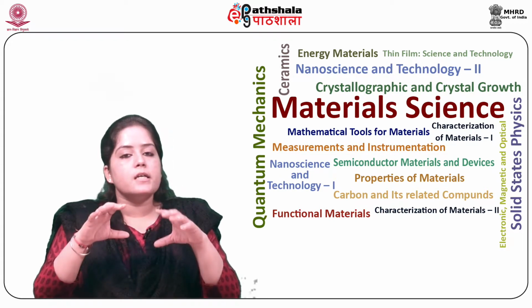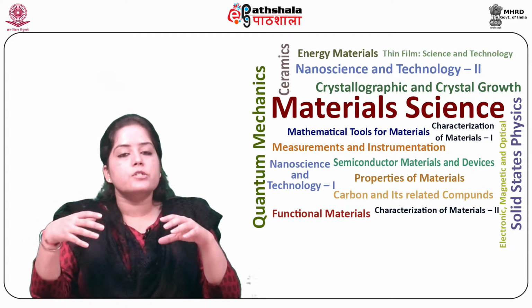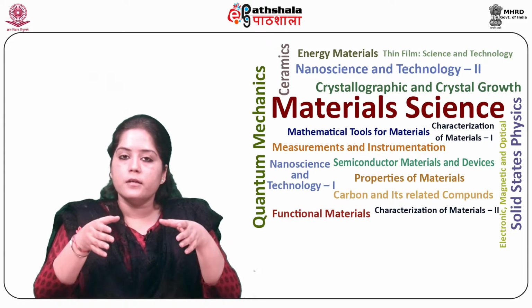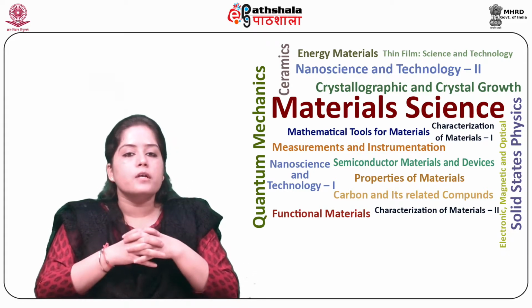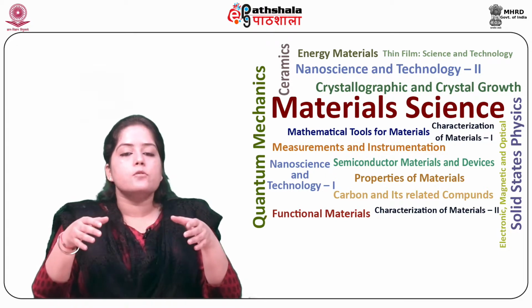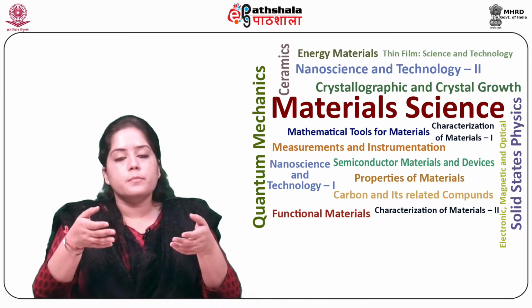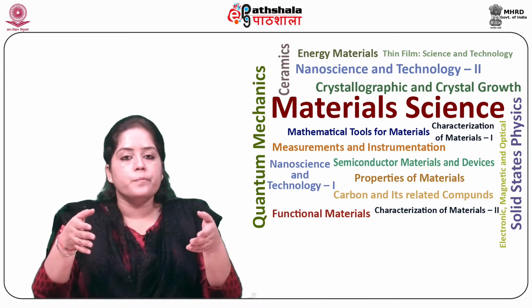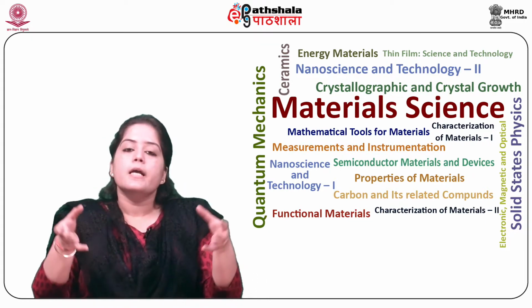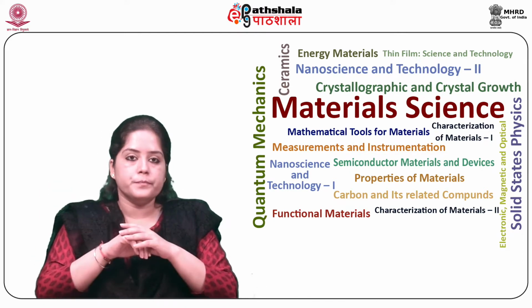Once the data has been obtained, it is converted into digital information using the mathematical algorithm known as Fourier transform. So the goal of any absorption spectroscopy, FTIR, UV visible spectroscopy, etc., is to measure how well a sample absorbs the light at each wavelength.